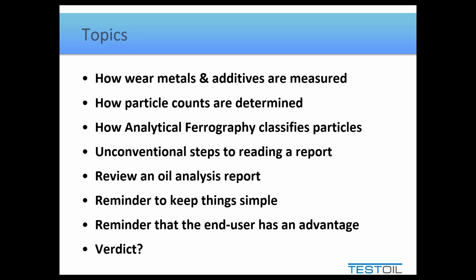And then just a little bit again briefly on analytical ferrography so that you have an understanding of what we're looking at when we actually get to reading a report. Once I've gone over those brief reviews, I will then show you what I call the unconventional steps to reading a report, because this is how you should go about reading oil analysis reports. Most people either don't know how to do it this way or just don't take the time to do it this way.